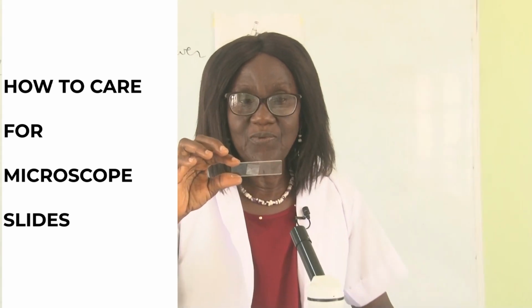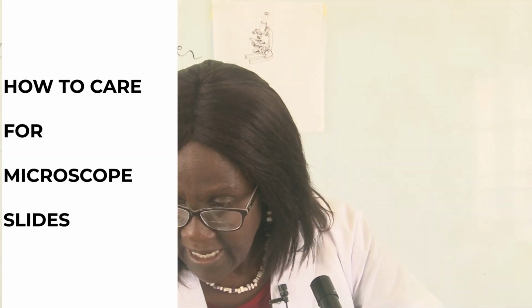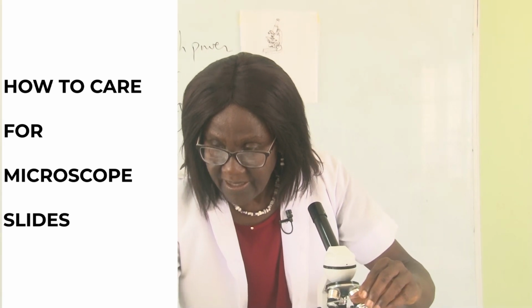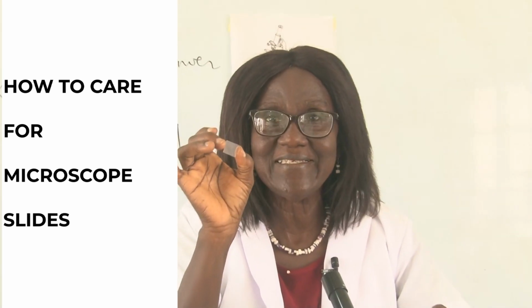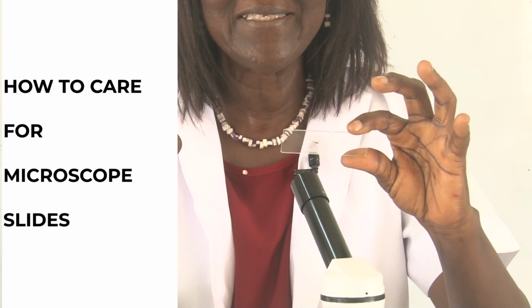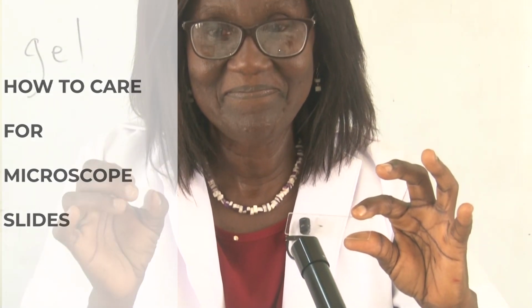This is the microscope slide. It should be kept clean and neat. So you hold microscope slides not at the top of it; you hold the slide at the edges every time. Cover slips are also very tiny and weak. They are also held at the sides, not with fingers on top. All right, that is how to keep microscope slides and cover slips neat.